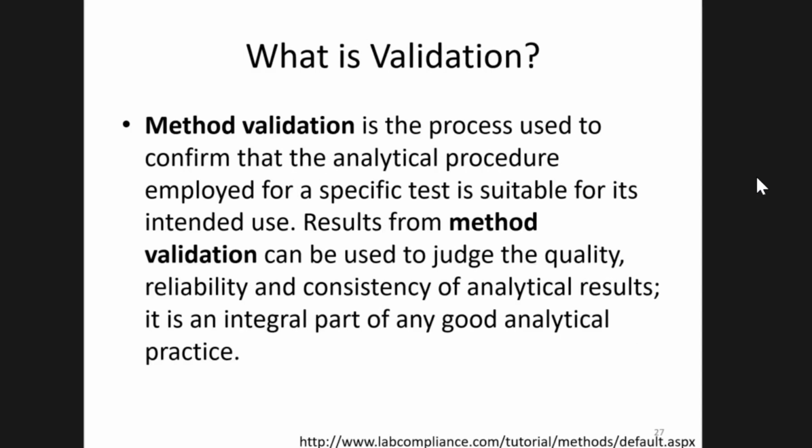Okay. Validation is not fun, but if you really want to trust your results, it's always a smart thing to do. I used to work at a biopharmaceutical company, and I worked in a group that would develop methods for peptide mapping and protein characterization that would be punted over to the group that would do the validation. And they would say it's mind numbing. They would make up solvents and forget to put the acid modifier in, or they would run the assay with the column backwards and make mistakes that are humanly possible and see how it affected the outcome.